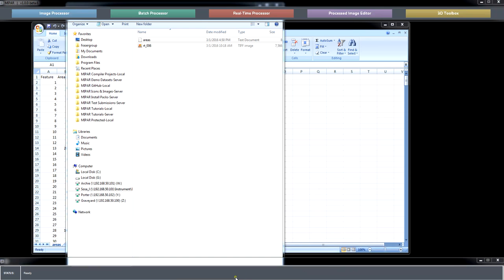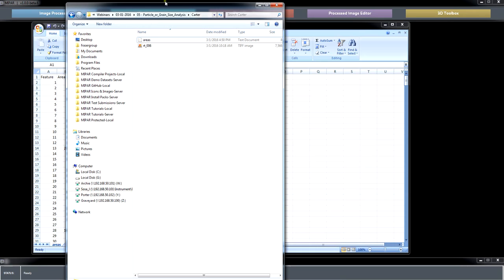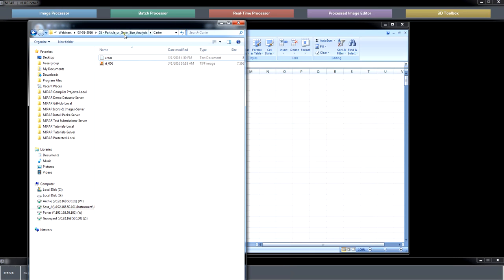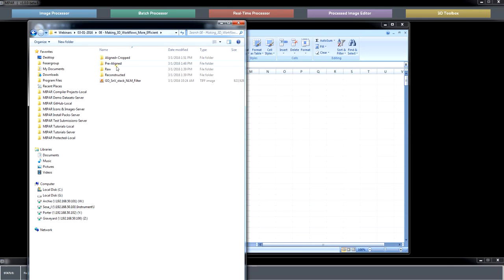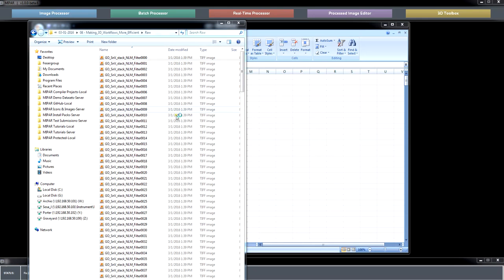I can show you the procedure that I would go through for it. It might be a bit more involved for this one particular data set. What I've got here is a dual beam FIB data set that Josh Einsel was very generous to provide, and he wanted to attend, but he couldn't.